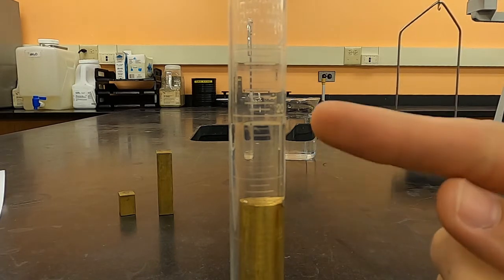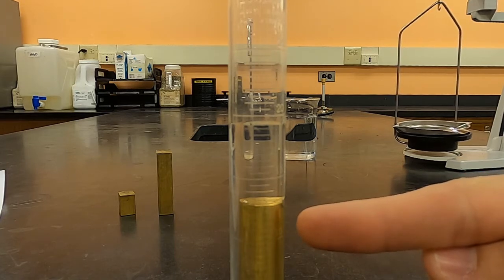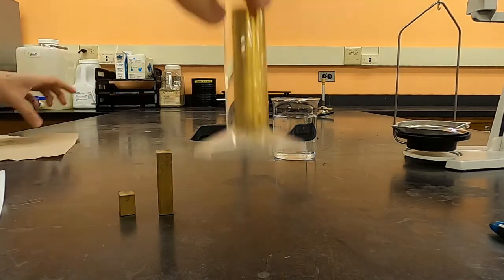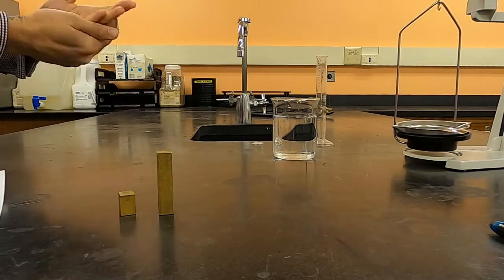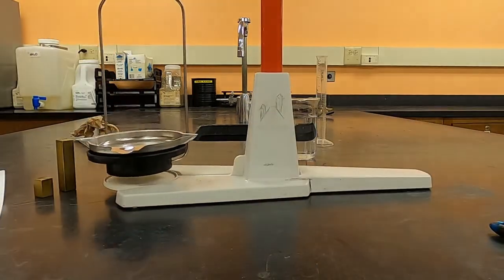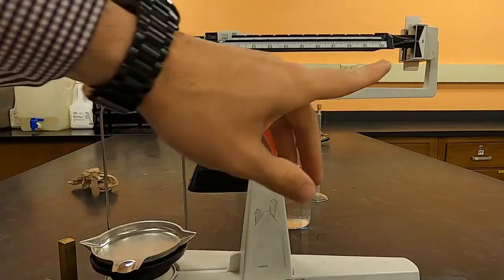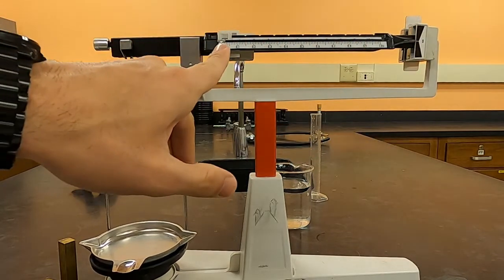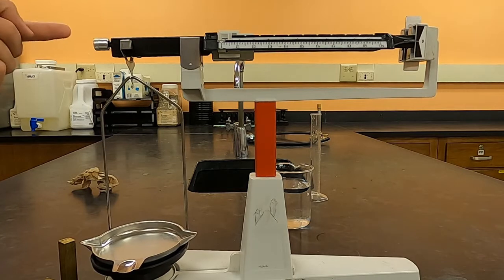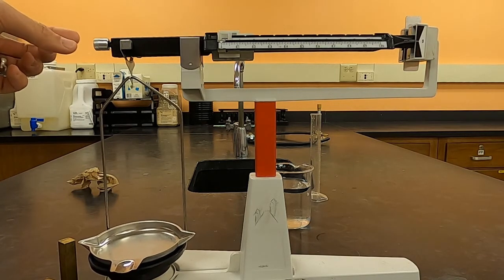The next step is to get the mass of this piece of metal. So I'm going to pour out the water, catch the piece of brass, dry it off, and put it on the quadruple beam balance. You can see that this quadruple beam balance is zeroed out. When every marking is at 0, it balances here, these two lines. If not, you'll want to adjust this end screw until it does balance.